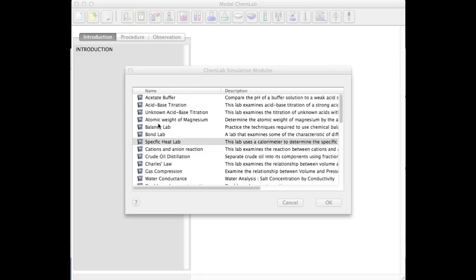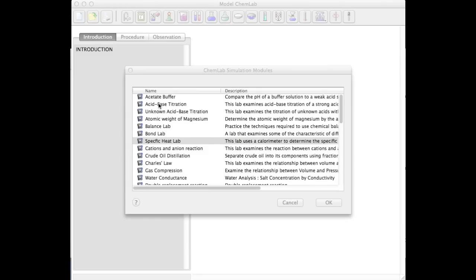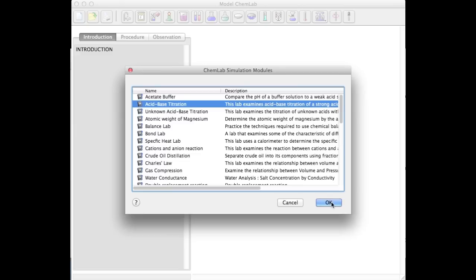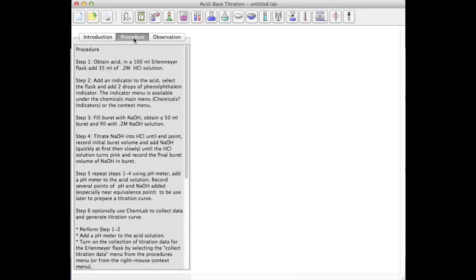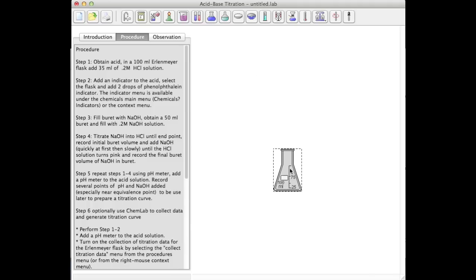The first thing you're going to see when you start the ChemLab program is the ChemLab simulation dialog box. Here is a list of all the available lab simulations in the program. I'm going to select the acid-base titration and follow the procedure for the acid-base titration using my procedure pane.